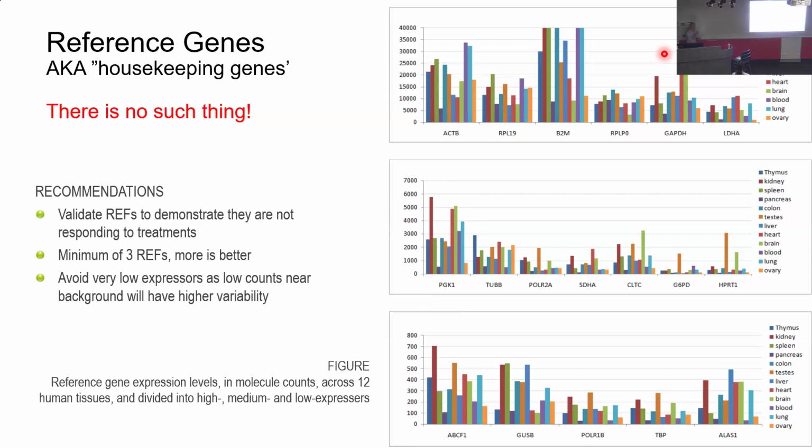Okay, so sample input normalisation. Does anyone struggle with that? Is this the thing you talk about? Is everybody comfortable, or want a quick rundown? Because it's important. And over the years, this was the single biggest question that came up. I used to do all the installs for the nCounter machines. And in the question time, there was great discussion and arguments about this. Just crazy. So I'll go through it now. There is no such thing as a housekeeping gene.